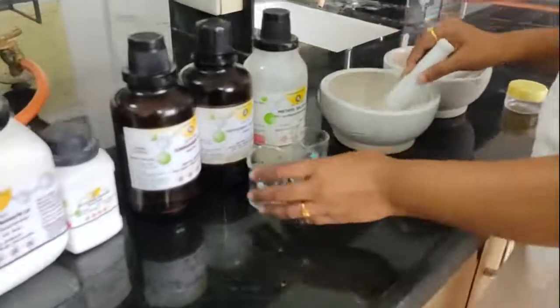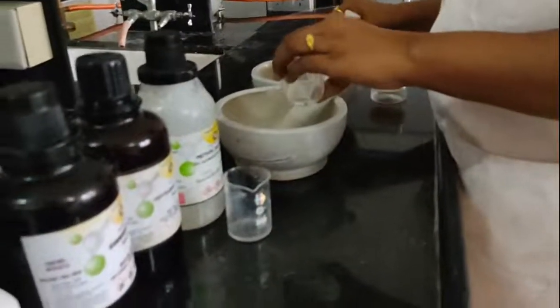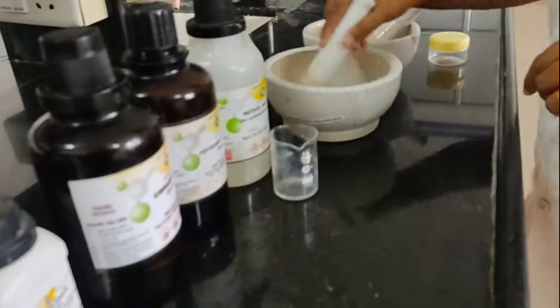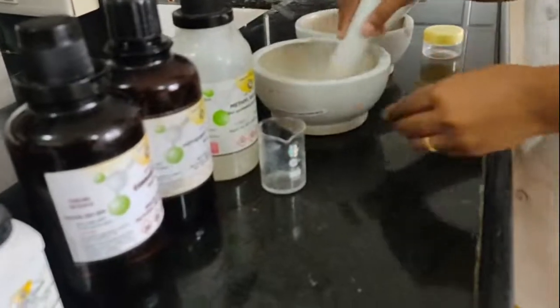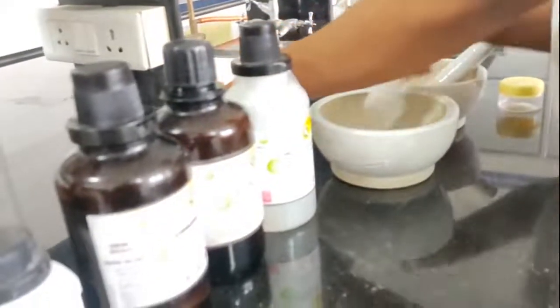Again, the next addition of this peppermint oil into this first mortar and also into this second mortar. Now again I am going to add this methyl salicylate into this first mortar and also into this second mortar.